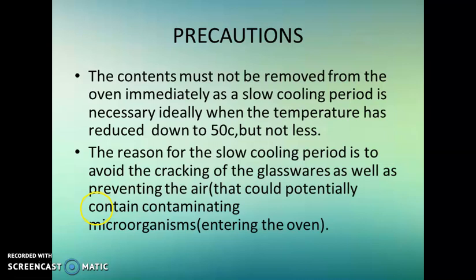If we open it immediately, all the temperature will flow down, so it doesn't ensure complete sterilization. So a slow cooling period is required. When the temperature has reduced to 50 degrees Celsius, but not less, then we can open and take the materials.